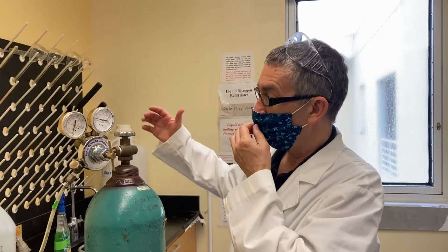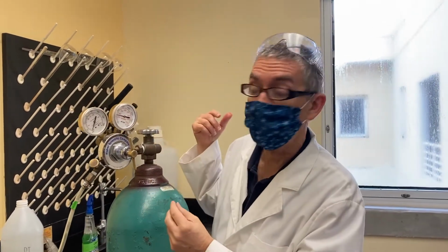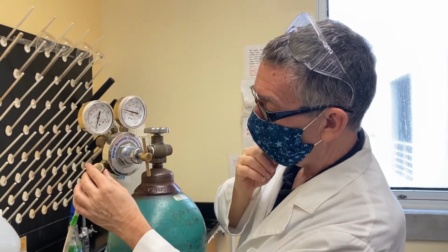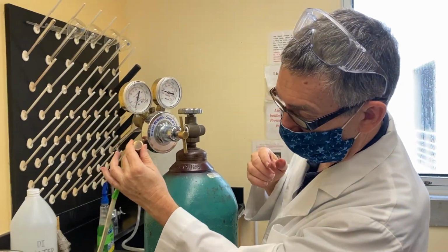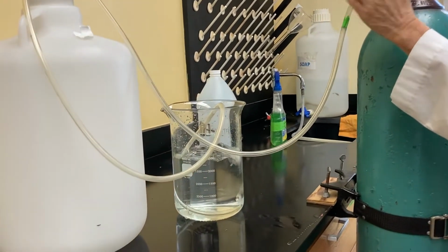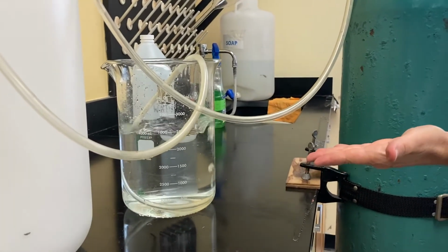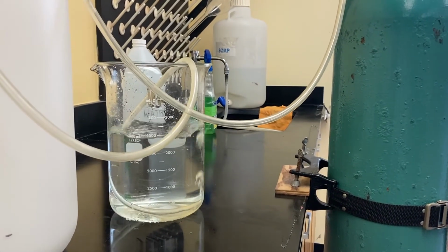Okay, so we're ready to now put gas, start the purging process. I've already got this to high pressure, this to lower pressure here. I want now to add some gas. I very carefully open this. There. Now, that's about what you want. It doesn't have to be real fast. And now we're going to let this purge for 15 minutes. You shouldn't have it be real fast.